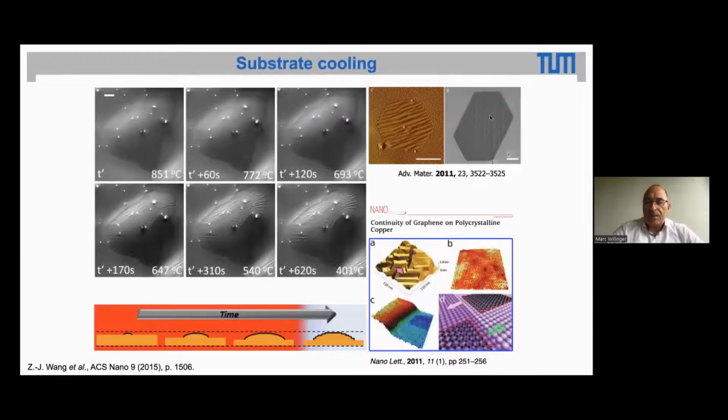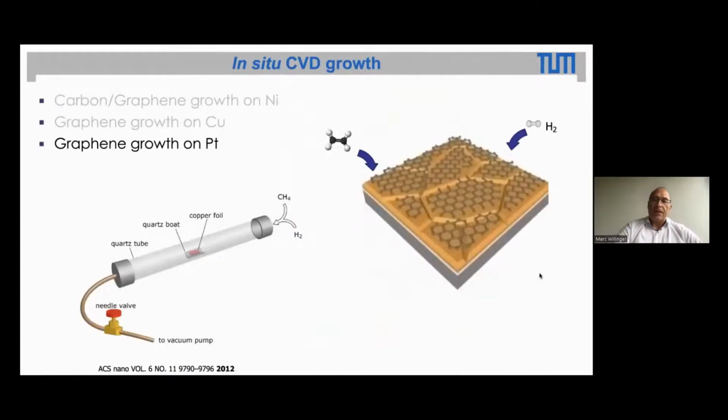So this is from literature. You see people have observed graphene on stepped surface, but this stepping actually happens during cooling. And there are lots of papers that describe how graphene grows on these steps, but in fact, it grows on a flat copper, and during cooling, this stepping happens. And this you can only see if you watch it while it happens. Anyhow, so copper was a bit complicated with issues with sublimation and oxidation and so on.